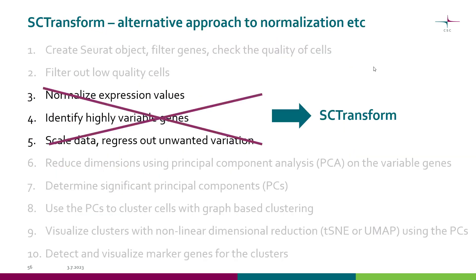SC-transform can actually perform various steps. It not only normalizes the expression values, but it also identifies highly variable genes, scales data, and regresses out unwanted variation.